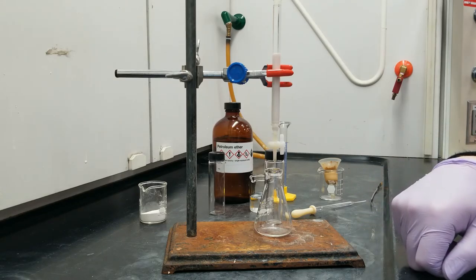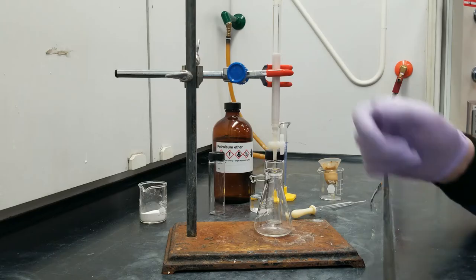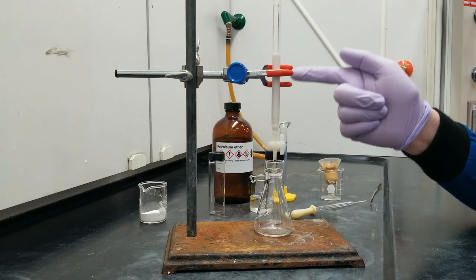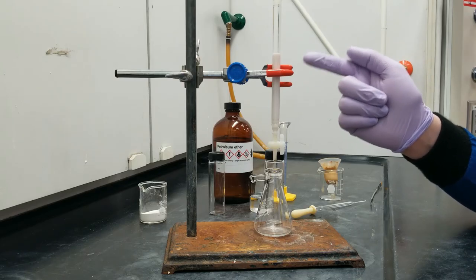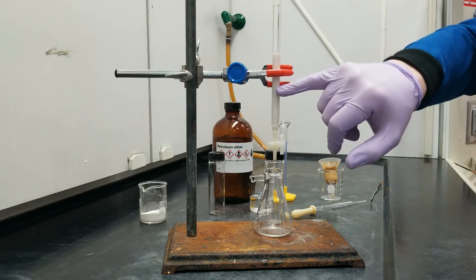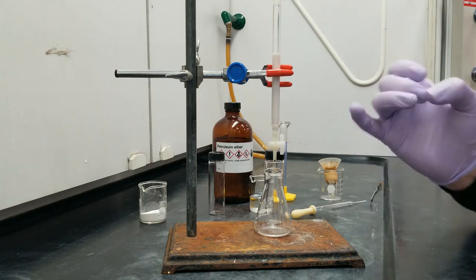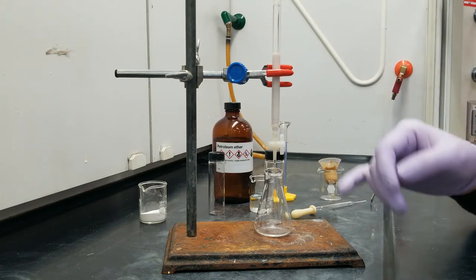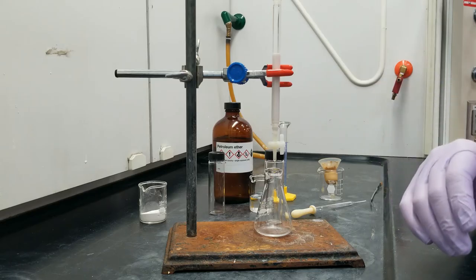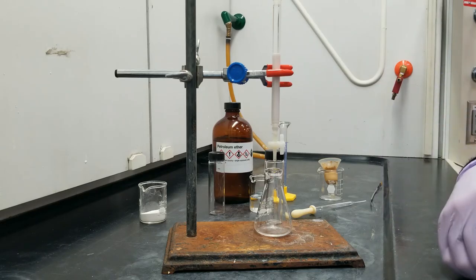So, like I said, air bubbles are the enemy here. This whole thing's wetted down with petroleum ether right now. If I were to get an air bubble caught right about here, that would actually stop the flow of petroleum ether, and nothing could make it past that. The dripping would stop, my column would need some adjustments, or I'd need to try it again.